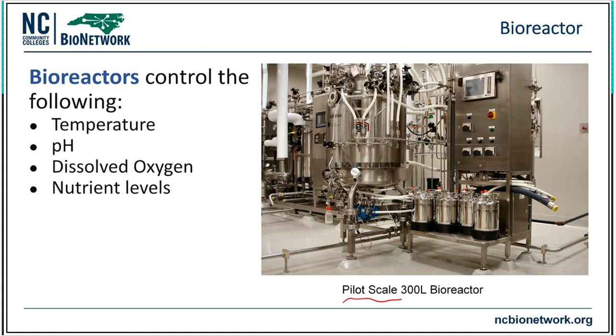And we're not going to destroy hundreds of liters of stuff. Instead, we're doing very tiny scales where we're working with maybe a liter, and trying to figure out the best optimal conditions to grow these things. All right, that's research and development. So those can be bioreactors, those can be fermenters, but they can easily go above and beyond the tabletop.